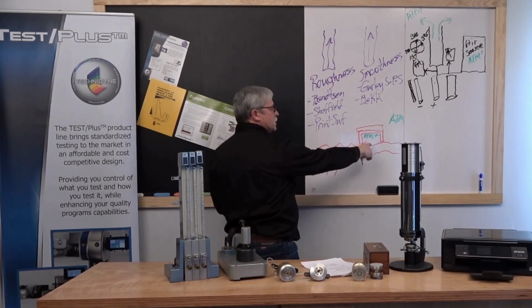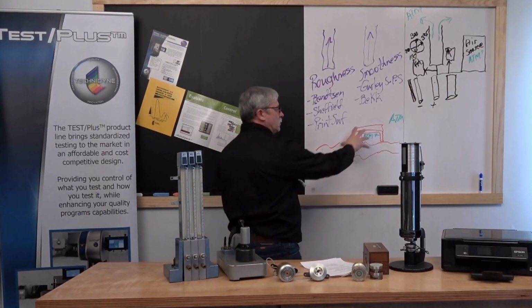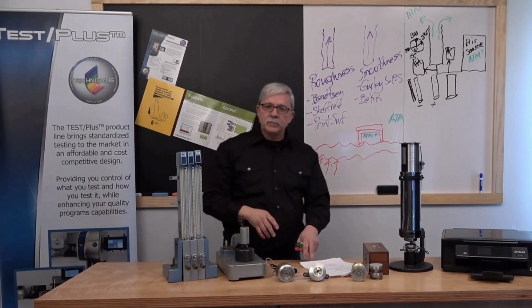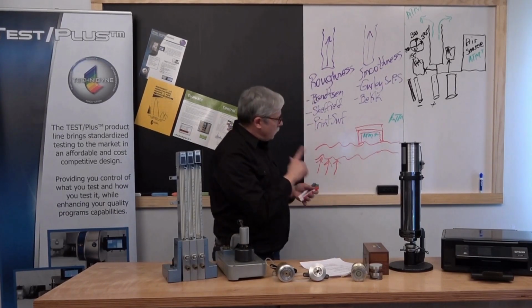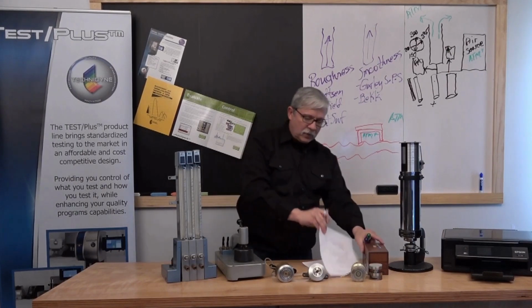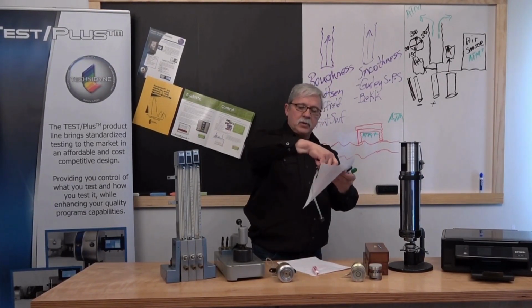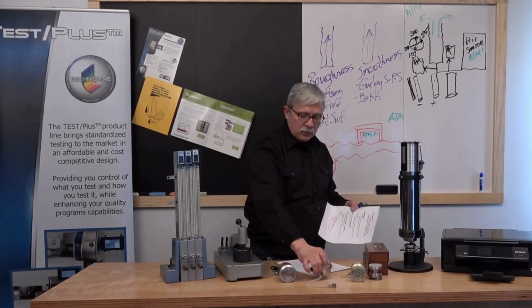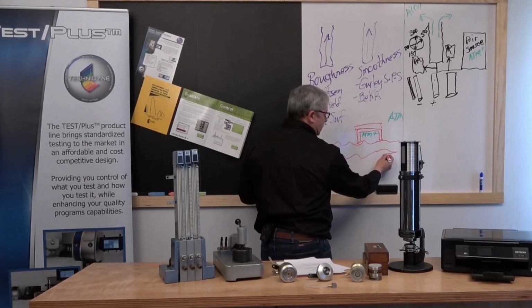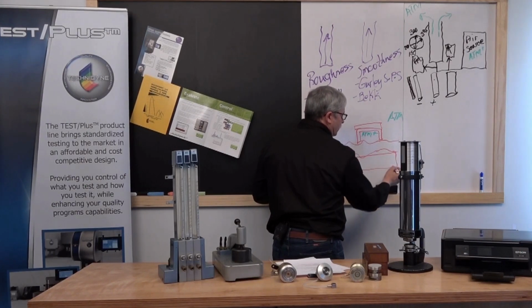If we pressurize inside this pocket underneath the measurement head, with the measurement head sitting on top of the sample, one more step we need to do is support that sample. If I have a particular measurement head and put it on top here, there's no means of capturing and creating that pocket. So we've got to support this sample with some type of firm backing.